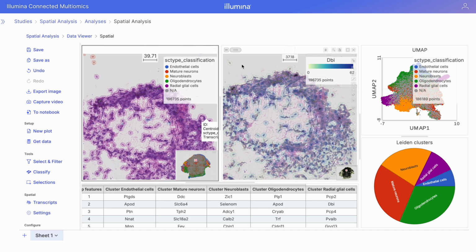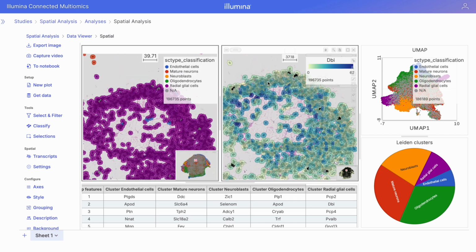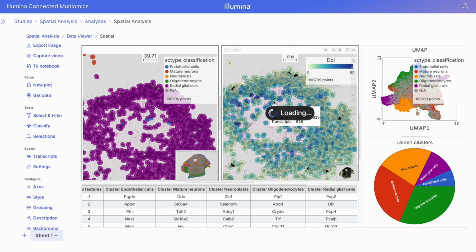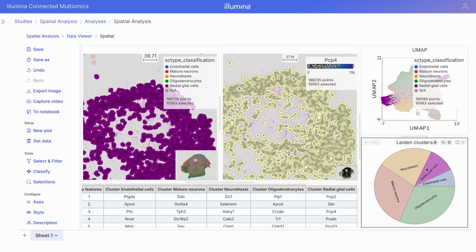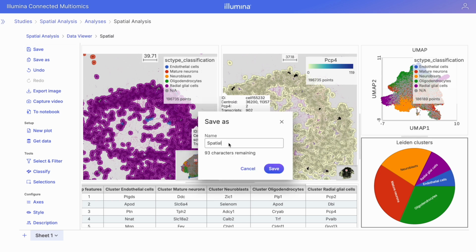By reducing the opacity of those cells, I can at the same time look at the underlying structures in my samples, or I can focus more closely on the expression of that marker in each one of those specific cells. Working like this in the data viewer can allow you to very quickly assess your data quality and the quality of the biomarkers that you have identified. Again, we're now saving this session for later use or later revisitation, and we'll be naming it cell classification.